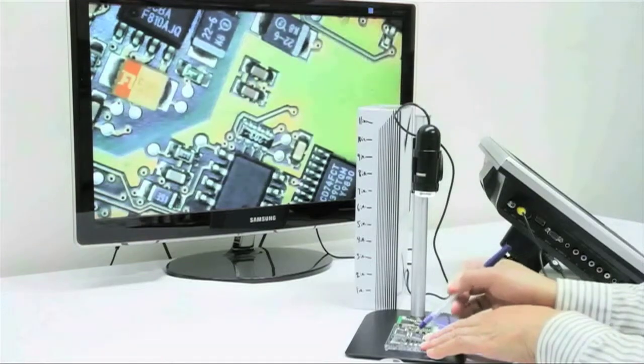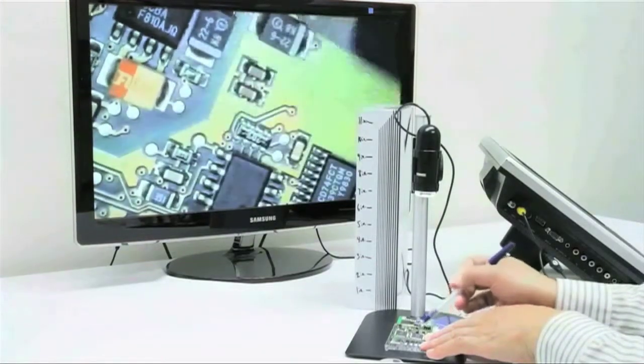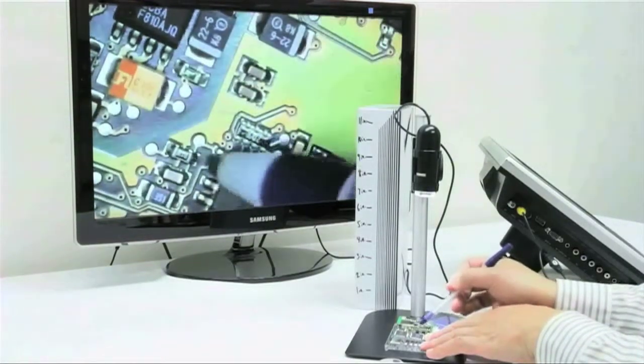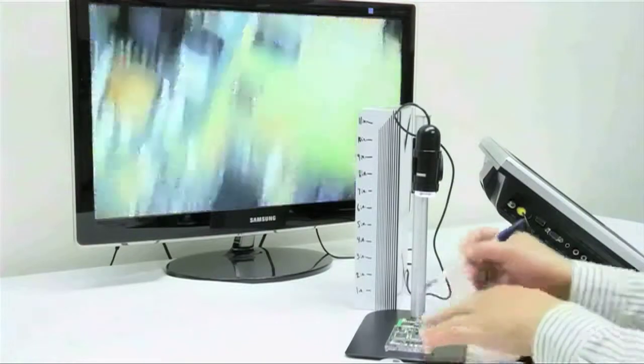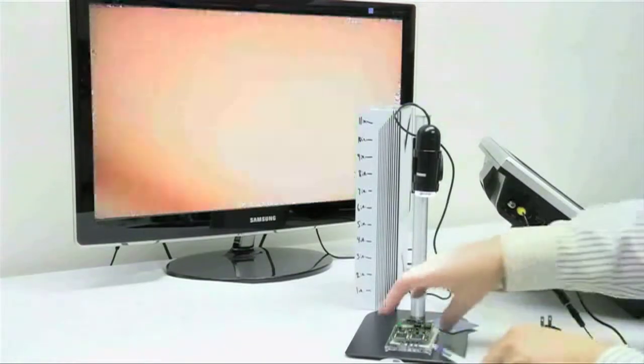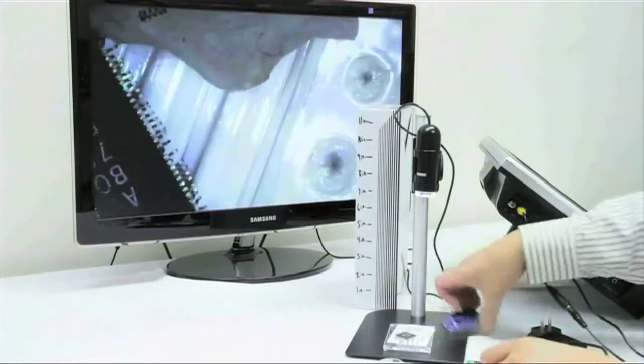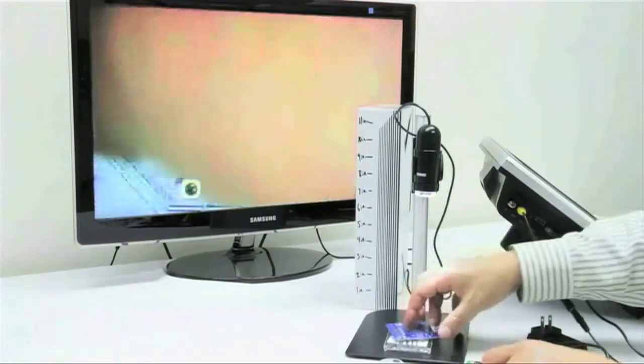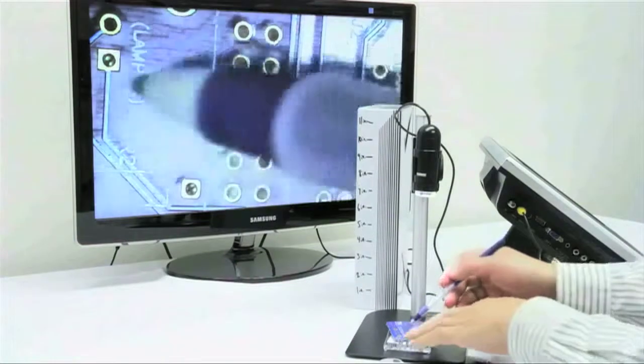This microscope has a magnification power of 10 times to 90 times the magnification and you must maintain a working distance of 2.2 inches or greater.